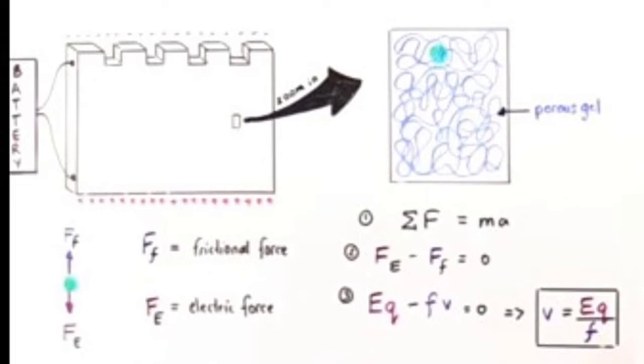So at this point, allow us now to employ the principle that falls under electromagnetism. When we are dealing with electromagnetism, when we have an electric field that is constant and working on a charge, we know that we can find the forces by applying the formula I'm about to write.